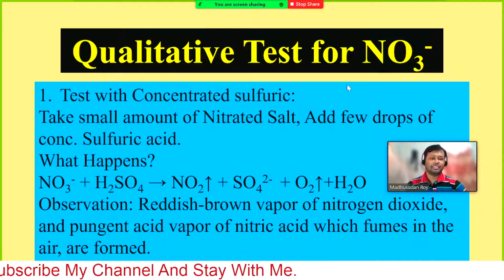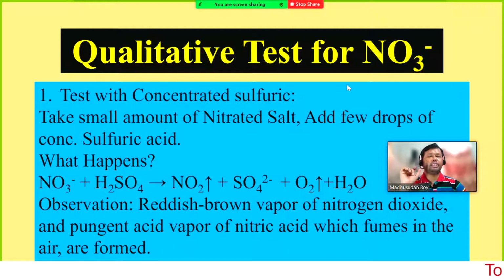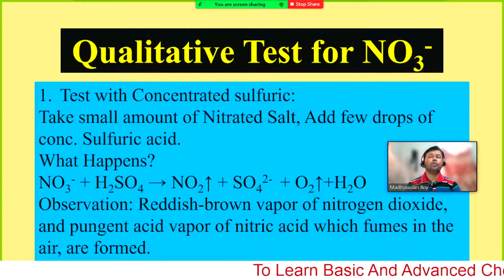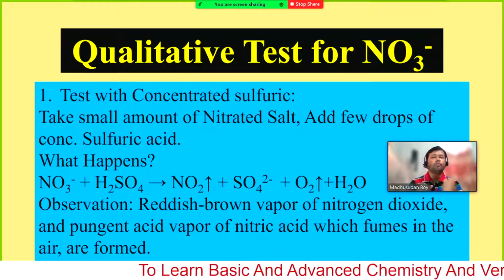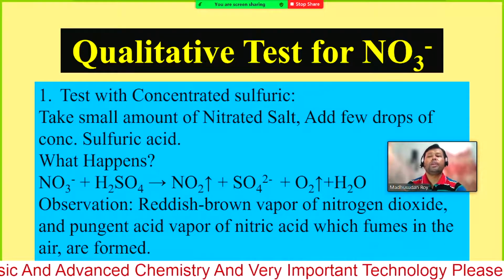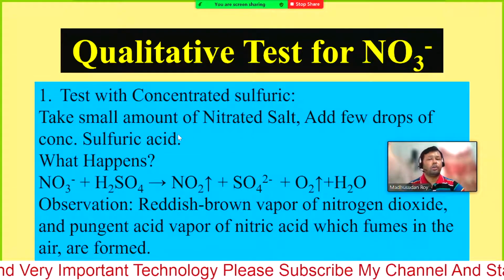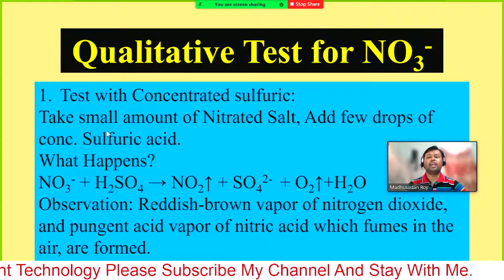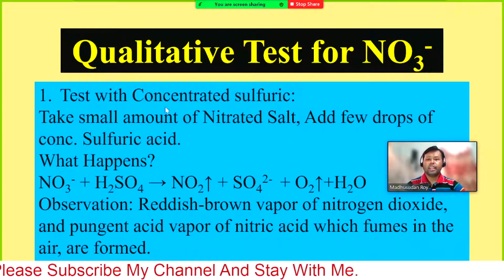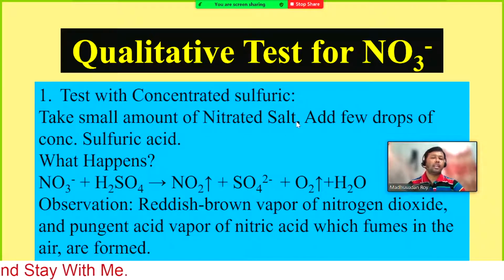That is very interesting. You can perform the test, but you need to be a little more careful, because if you are not careful, you will never be able to form the ring. How can you perform the test? First, you have to prepare the original solution. Later, in the next test, I will show you the ring test. But this is another test, the test with concentrated sulfuric acid.